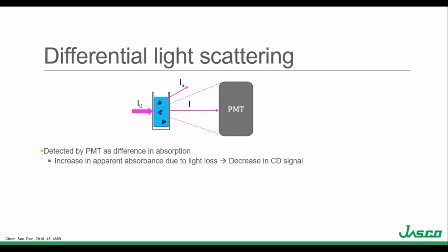A translucent sample could lead to differential light scattering or absorption flattening. Differential light scattering occurs when particulates in the solution are too large relative to the incident light that's scattered. The detector has an acceptance angle describing the maximum angle of incident light that reaches the detector surface. While some light can be scattered and still fall within that acceptance angle, any light outside that range does not reach the detector. The detector can't differentiate between absorbed and scattered light, so it assumes any undetected light was absorbed, creating apparent absorption that decreases the CD signal.